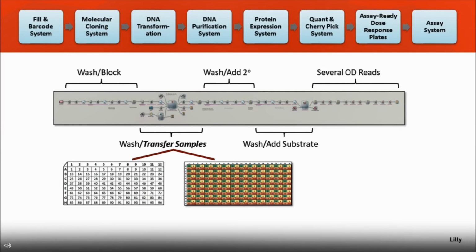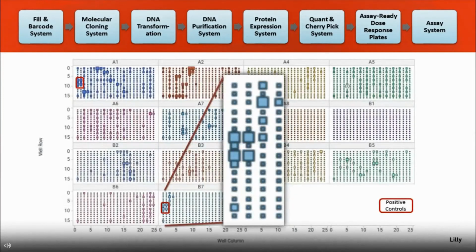And then one of the nice things we're doing is our samples are coming off in 96-well format, and we're able to use the BioMek. These ones are actually being normalized on the Links prior to running the ELISAs. So we have a flat concentration of typically up to 96 samples in a 96-well plate. And then we're transferring into 384 ELISA plates, and on the I7 we're doing a 4-point dilution. So we're able to run dose response plates in a quadrant format by going from a 96 to a 384-well plate. And so we've generated results that look something like this.